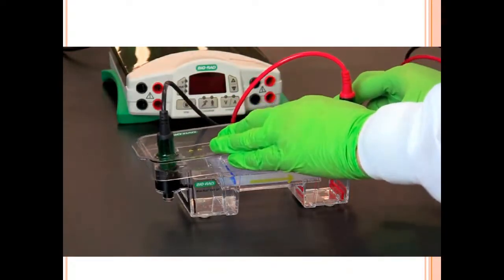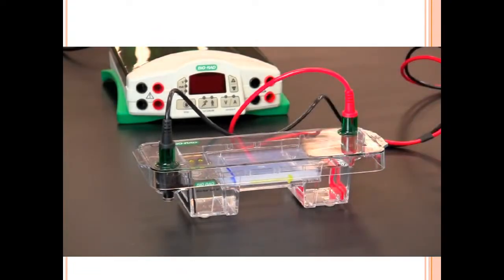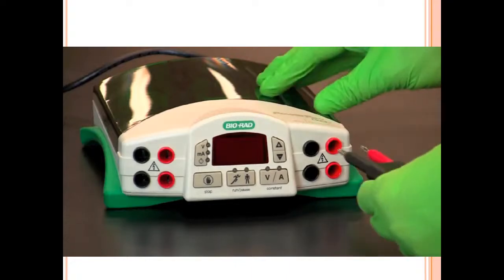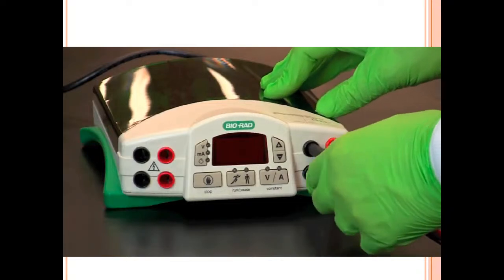Place the lid on the gel chamber with the terminals correctly positioned to the matching electrodes on the gel chamber, black to black and red to red. Connect the electrodes to the power supply, again making certain the electrodes match the terminals on the power supply, red to red and black to black.